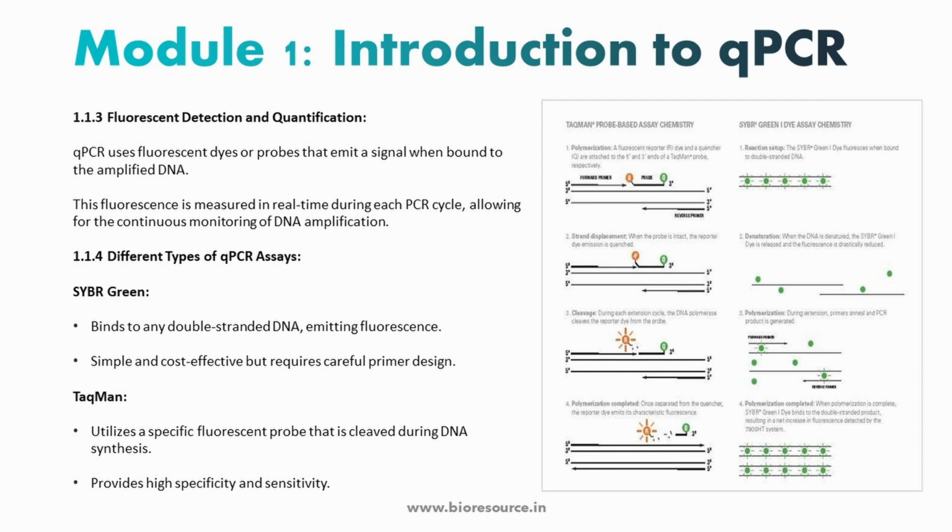So what happens is normally a probe in its native state has the reporter and the quencher in close proximity, and the fluorescent signal emitted by the fluorophore or the reporter will be captured by the quencher. But during the elongation phase, the Taq polymerase cleaves the probe, and that makes the reporter and quencher far apart, and there will not be any quenching during that phase because the quencher is further apart from the reporter. So the fluorescence emitted will not be quenched by the quencher, and you will get a fluorescent signal. When the DNA amount present in the sample increases, your fluorescent signal also tends to increase accordingly.